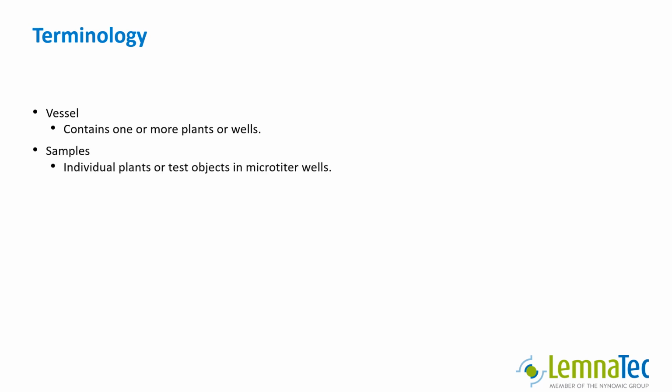In terms of analysis and result evaluation, these individual plants or wells are the actual samples. Therefore, the samples of Lemna control are called vessels in LemnaExperiment, and the individual plants or wells are called samples. Vessels may contain multiple samples or just one.